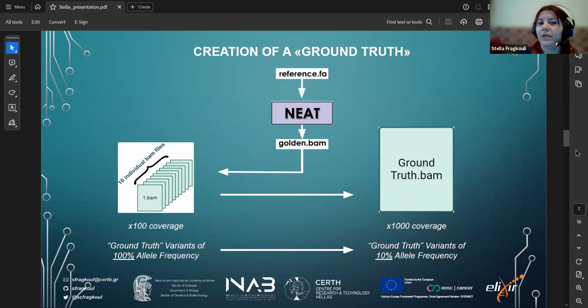So this was very important for us because mapping is one of the 4 major pillars of variant calling, but there is a source of errors because of the mistakes that the algorithm can make. So we had already aligned reads to the reference, so we were ready to take it away to the variant callers. Because we wanted to emphasize the small frequencies, around 10% and lower, we somehow wanted to take control of the process of the creation.